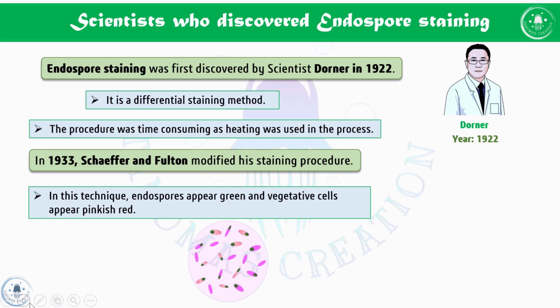This is how the cells will appear after the staining. Not all the bacteria take up the color.